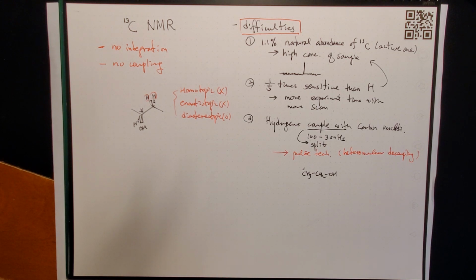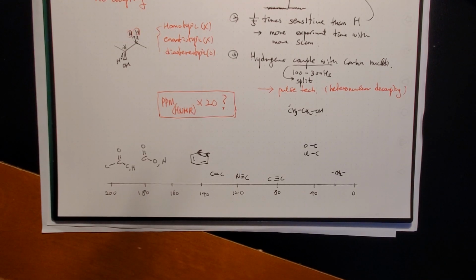The only thing you have to figure out is how many types of carbons you have and where they appear. And in order to find out the number of signals, you apply the symmetry, mirror, rotation technique to match up. Then that's about it. All right, first, the locations.